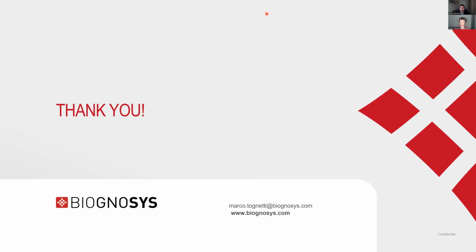I forgot, there was also the question of how long it takes to do the search. That's actually a great question. And we find that, depending on the computer you have, you really want to try to limit the search space. So what you can do is, once you notice that you have good quality data, you don't have to look for 25-mers if you know you don't have any in there. So you can limit your search to the sphere of peptides you are actually interested in. And that will speed up your analysis a lot. Another setting that helps a lot is the maximum number of PTMs that you allow per peptide. Reducing that, especially if you have short peptides, makes a lot of sense and will already reduce your search space a lot. So it's resource management.